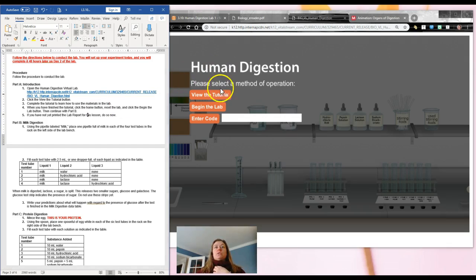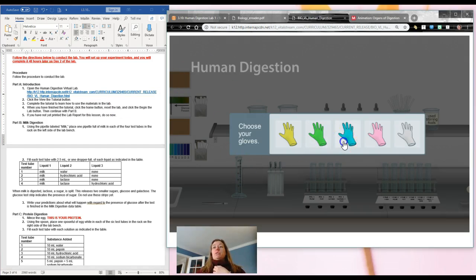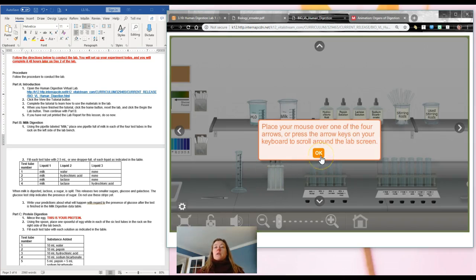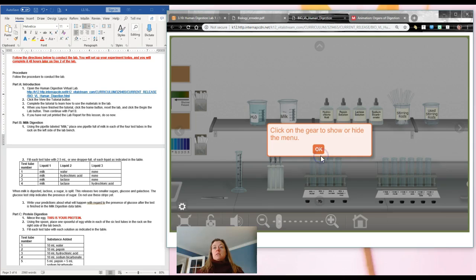All right, we're going to click the tutorial button first. We're going to choose our gloves. I like blue. I don't know why. I just always choose blue. Hit start. And then it's going to walk us through the process.